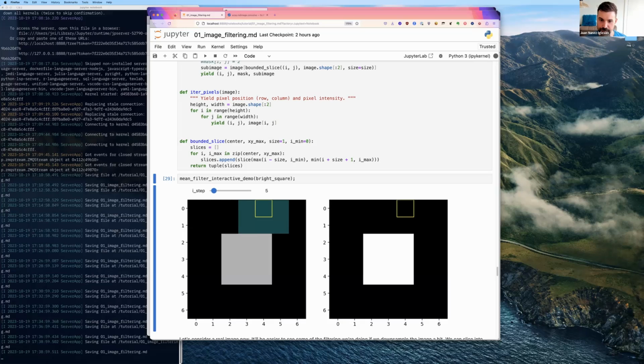And then we're going to change the output array here as we walk over the input array. So the first row only catches zeros, so all of these values are 0 in the output. We're still only catching zeros in this position, but now we're catching a 1, so 1 position here. And it's hard to see, but this has become a little bit brighter. And as we move right, it increases linearly in brightness and decreases again. Okay, so now you can see that it goes 1/9, 2/9, 3/9, which is a third, and then decreases again.